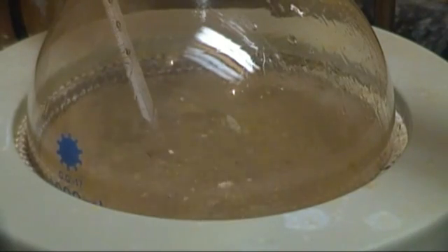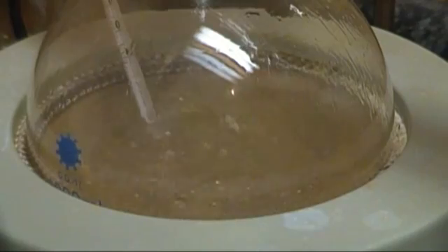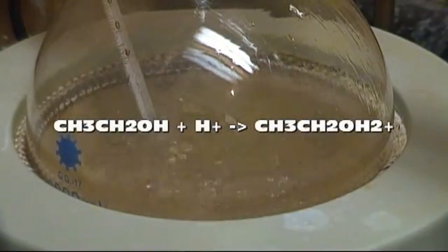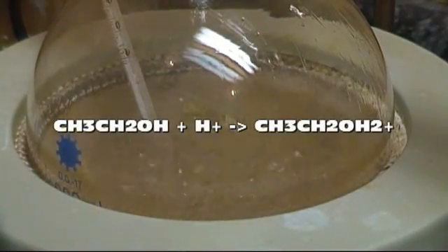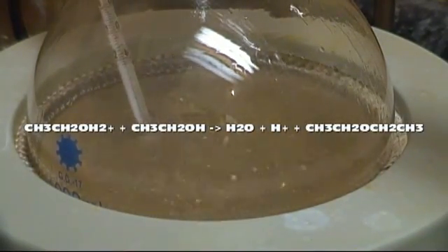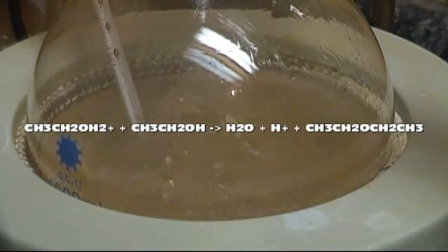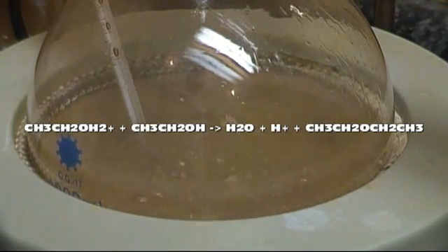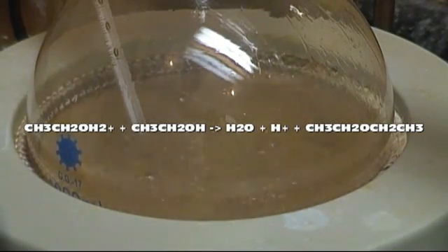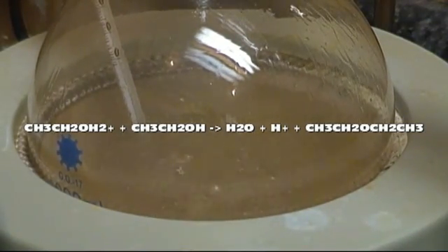As far as the reaction goes, we are performing an acid ether synthesis. Sulfuric acid dissociates, producing hydrogen ions. The hydrogen ion then protonates the electronegative oxygen atom of the ethanol, giving the ethanol molecule a positive charge as can be seen in this equation. A nucleophilic oxygen atom of an unprotonated ethanol molecule displaces a water molecule from the protonated electrophilic ethanol molecule, producing water, diethyl ether, and regenerating the acid. Once formed, the ether is removed by distillation, allowing for more ether to form. As the amount of water increases, less ether forms until nearly no ether forms at all.